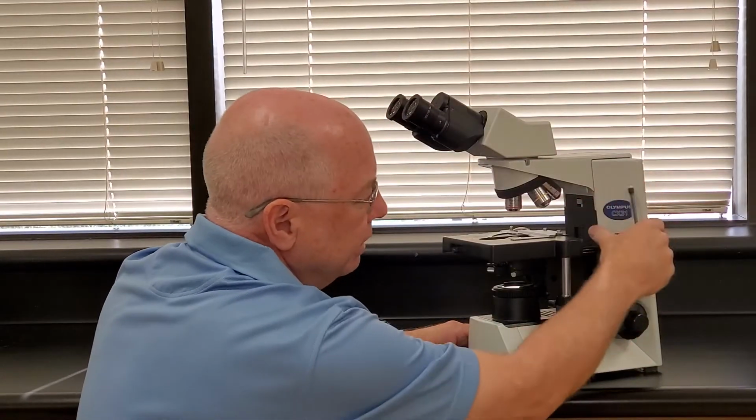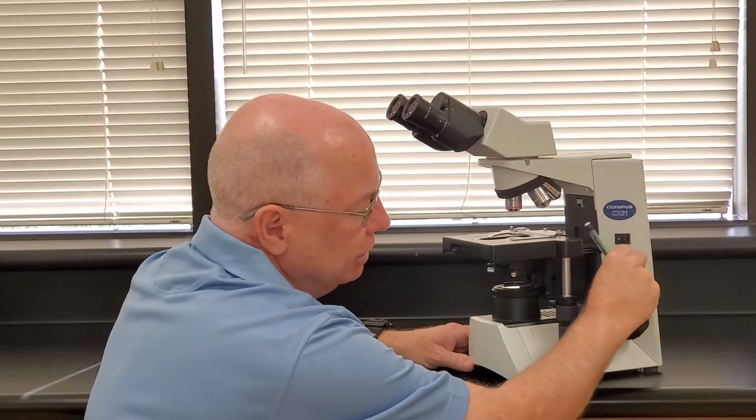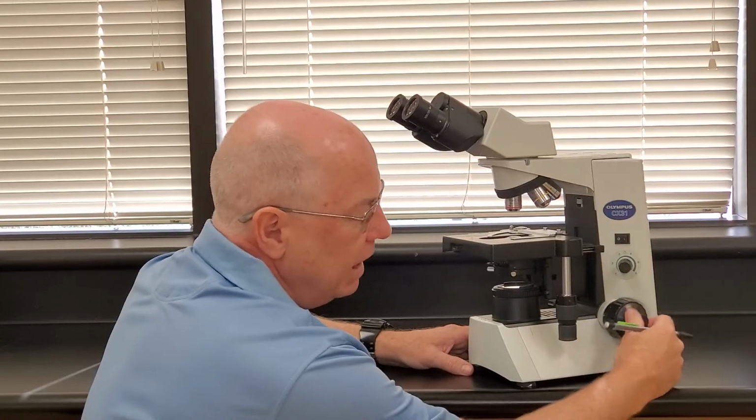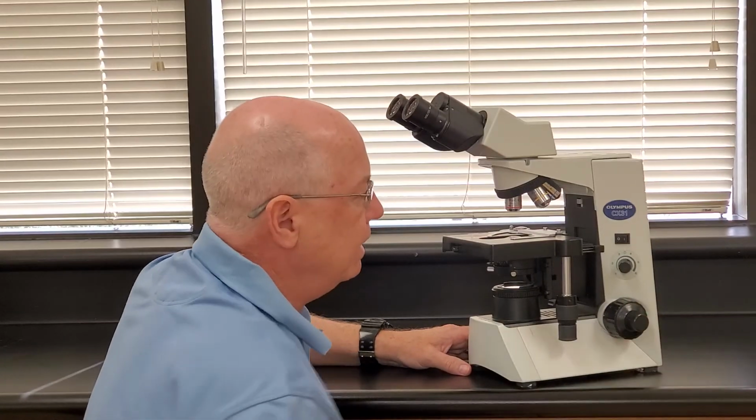Over here on the body, you need to know the on-off switch, the light intensity control knob or the light control knob. You need to know the coarse focusing knob and the fine focusing knob. Okay? Those are the parts I want you to know for the lab test. Everything else is just a little extra.